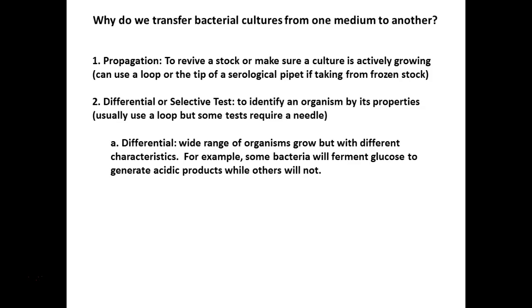If we want to find out a little bit more about the organisms we're working with, or to select for ones that we're potentially wanting to look at, we can use media that does more than allow growth. And sometimes, depending on the media, you're going to be adding the organisms either with a loop or a needle, depending on how the test is performed. So differential media, usually a wide range of organisms will grow on it, but their growth patterns will differ based on the abilities of those organisms.